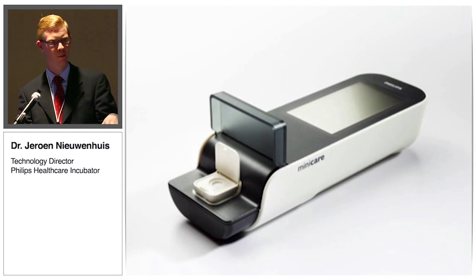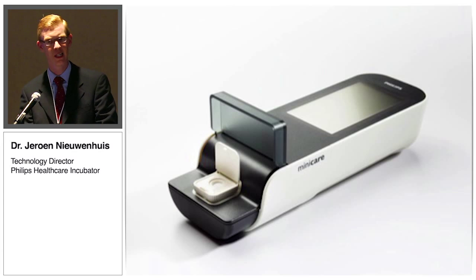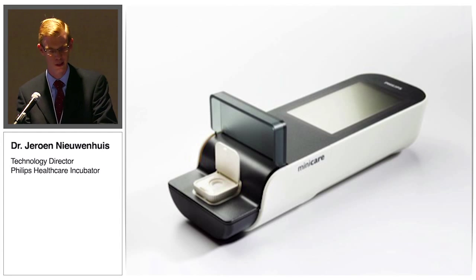So by combining these elements, the simple fluidics, high degree of control, and also the fast reaction kinetics by the short diffusion distances, we hope to meet some of the challenges and get a sensitive and precise assay, at the same time using a very small amount of reagents. So the entire reaction volume in one chamber is only a quarter of a microliter. And that also explains why we can work with finger stick samples.